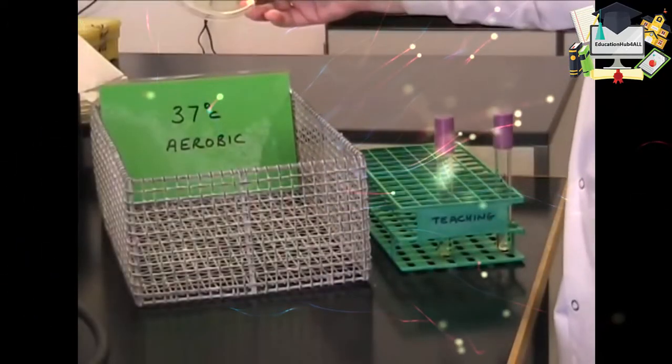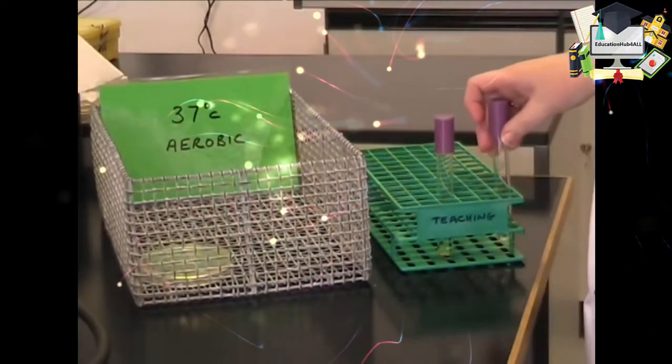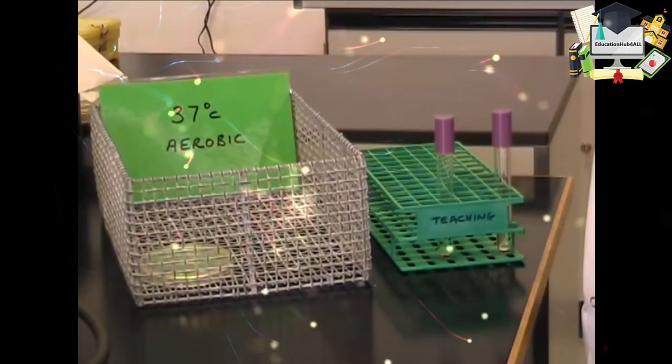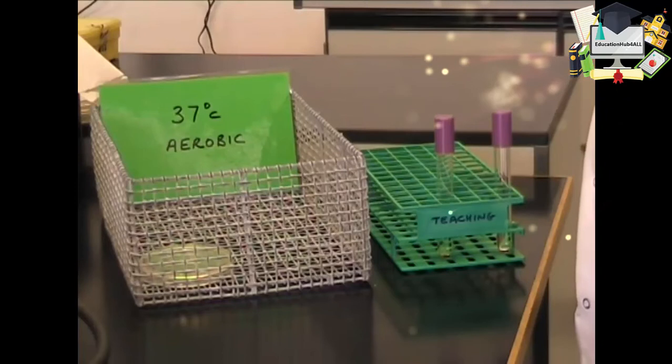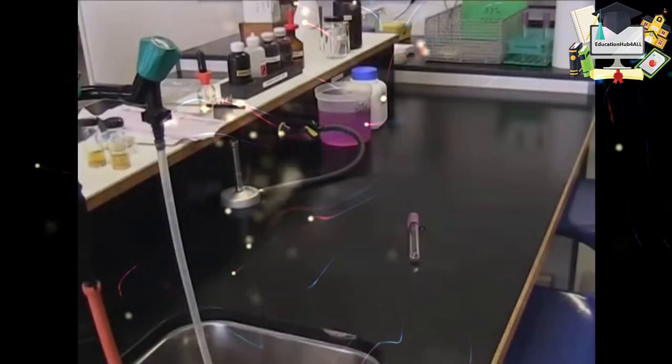Make sure you place all your labelled tubes and plates in the correct basket or test tube rack for incubation. Check the temperature and the conditions written on the label. At the end of your practical, you might have equipment or materials that you haven't used. Ask the demonstrator in your practical what you should do with these items.